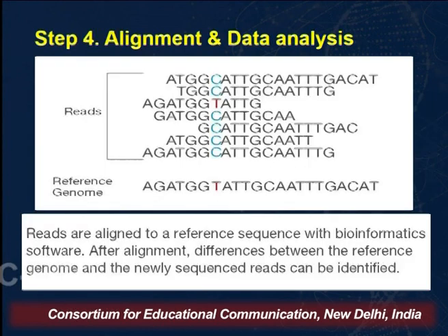Then when you get multiple reads, these reads are aligned together and they are also aligned to a reference genome.